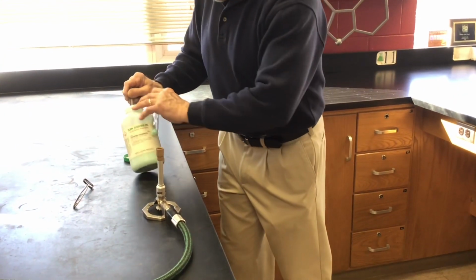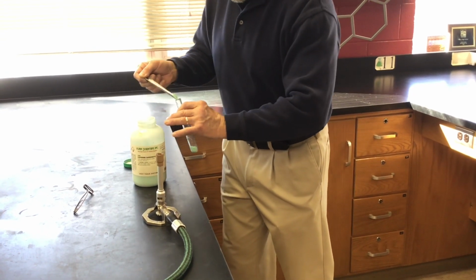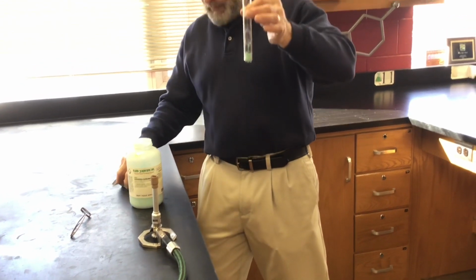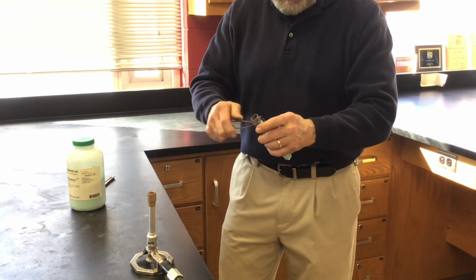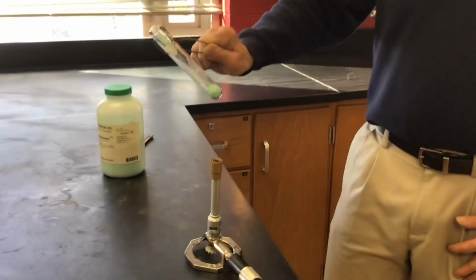And then we'll put some into our test tube. I think the lab says use half an inch maybe. Put a little more. That should be enough. Okay, so we'll use a test tube holder to grab the test tube, and we're going to start to heat the copper carbonate.